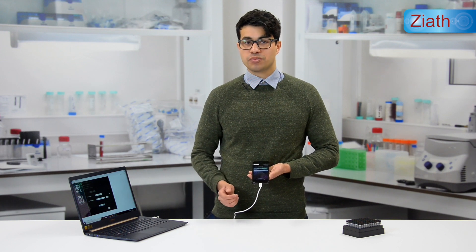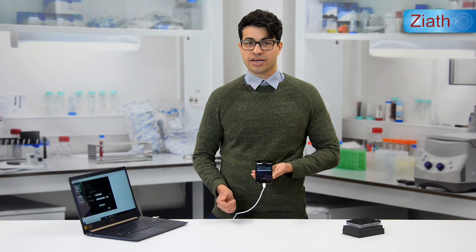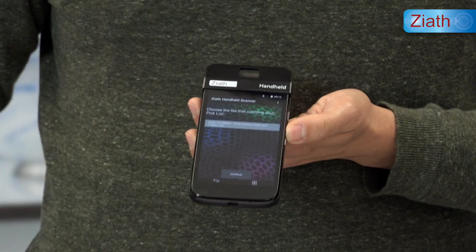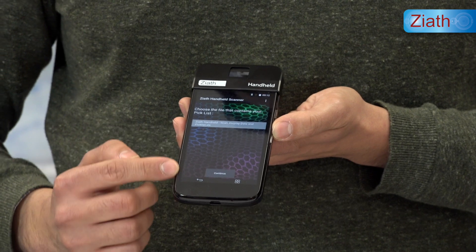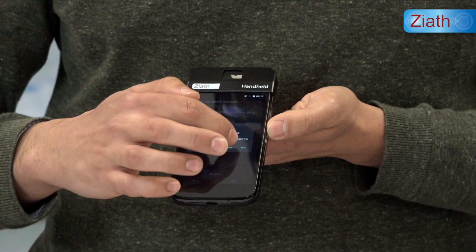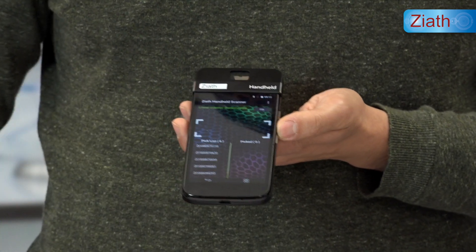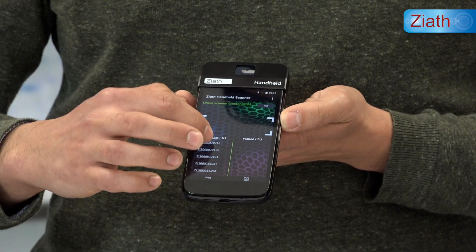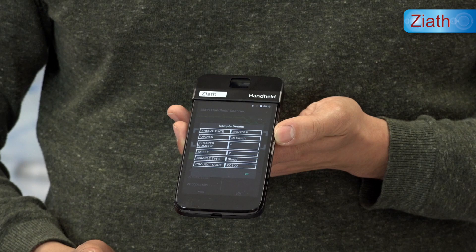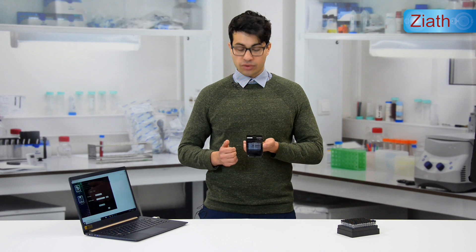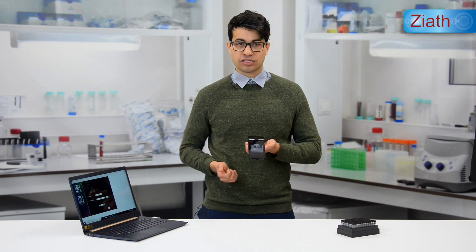For use of the handheld client you must be connected to the computer via the micro USB cable. The file placed onto the handheld can be seen here, and you can store multiple files which will be shown in a list. We can click on the file we wish to open, click continue, click no to give a fresh reads date. The list of tubes that need to be collected will be displayed on the left hand side. We can click on individual tubes to display the sample information, with column headers shown on the left and sample information on the right.